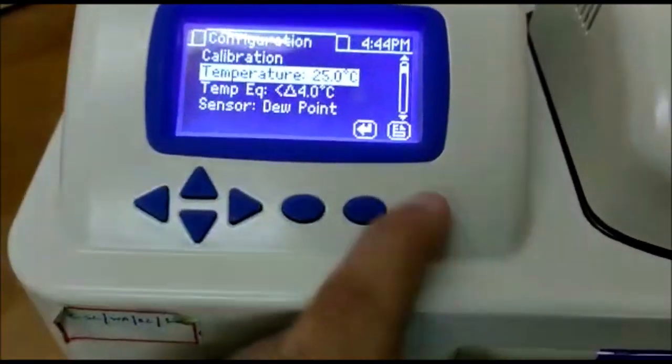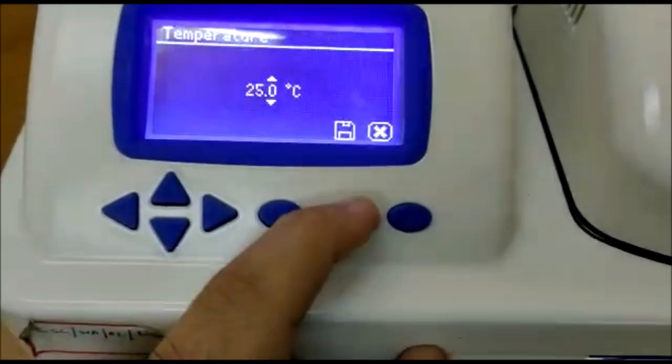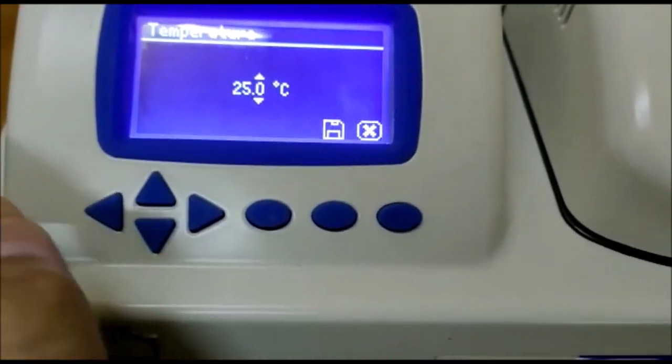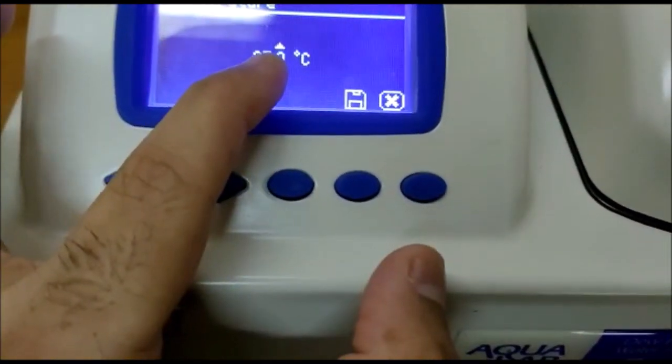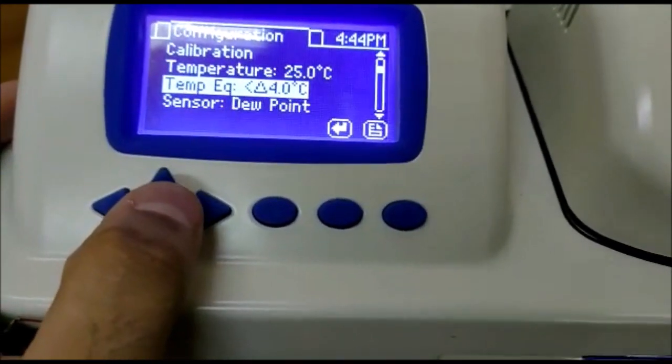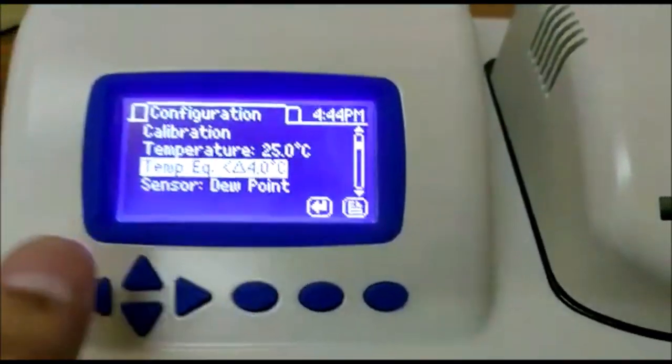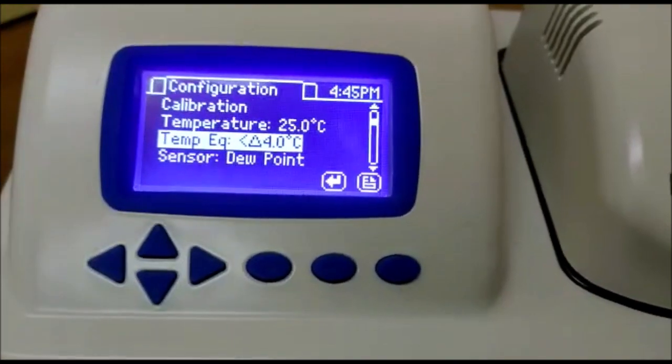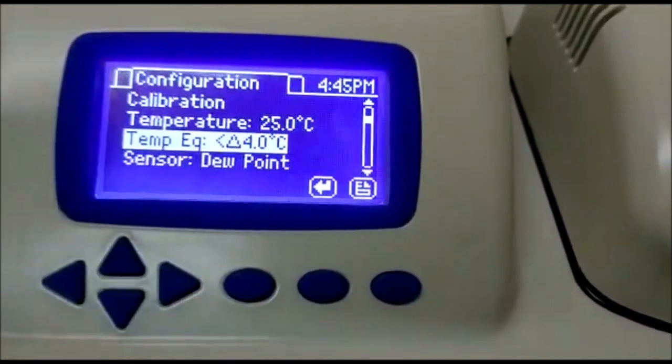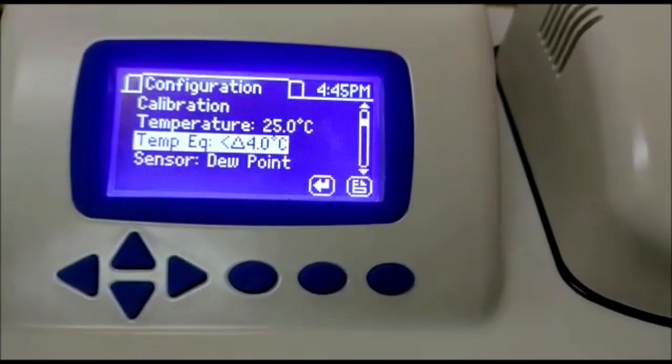Aqualab 4TE has a feature to change the temperature. By default it is set at 25 degree centigrade which is more or less ambient here. And you can change this value from 15 degree centigrade to 50 degree centigrade in gradations of 0.1. Here we have temperature equivalence which is right now showing less than delta 4 degree centigrade. It means it can detect if either the sample is hot or cool with the temperature we have set. Right now this instrument at temperature 25 degree centigrade will measure the sample which has a temperature up to 29 or 21. It means plus 4 or minus 4.